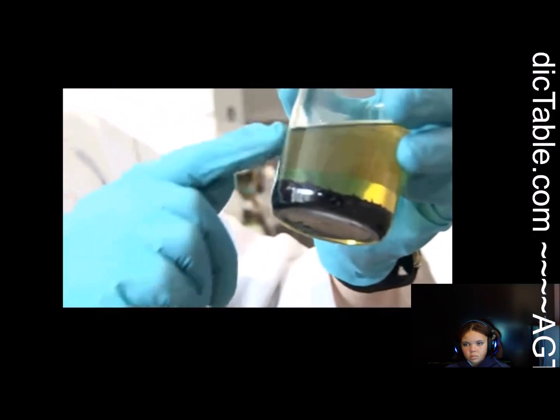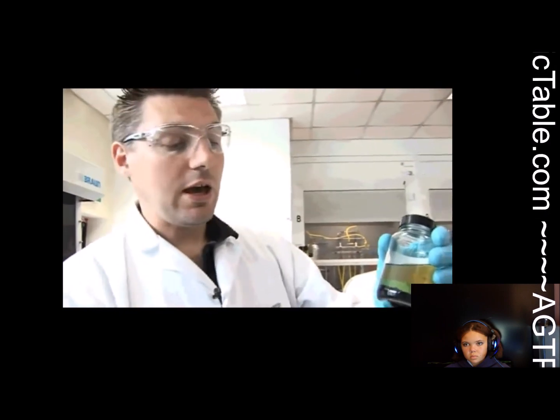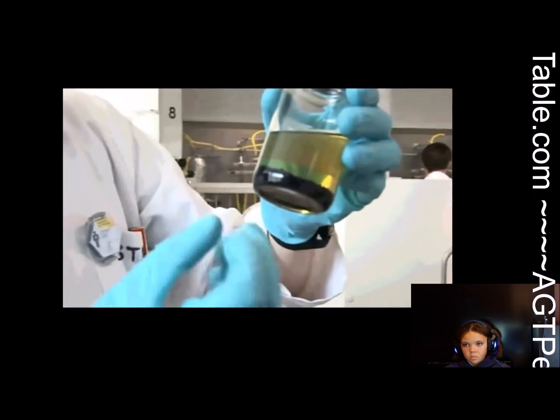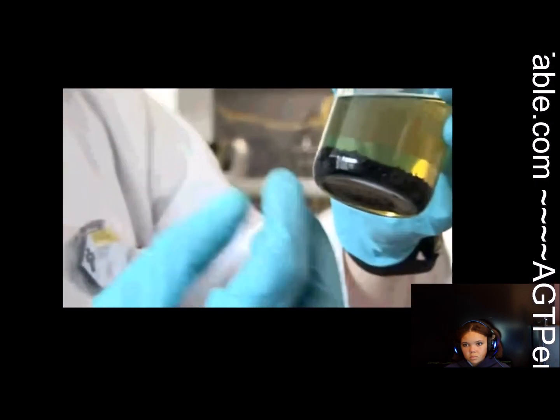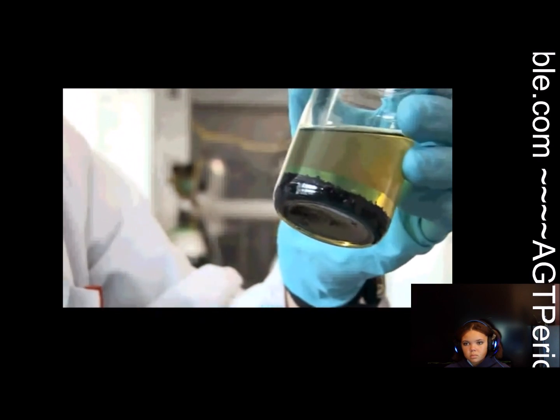This is just oil sat on the top, so just like we had to have oil to protect the potassium, we also need oil to protect the uranium turnings. If you really finely divide uranium turnings, they're pyrophoric, which means they burst into flames in the air, just spontaneously. But it's actually a really interesting element to deal with. It's got a wide variety of oxidation states. And if you use it in its depleted form, it's actually relatively safe to handle in the laboratory.